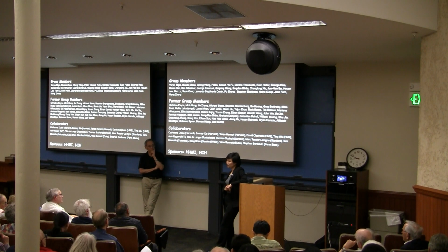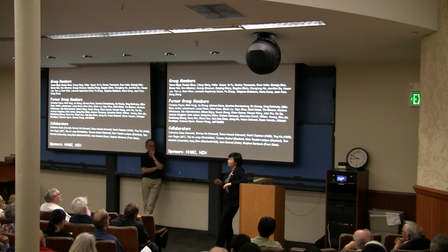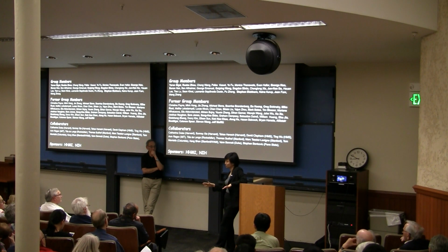So if we use some of the perturbations that we have, such as disrupting the actin to remove the entire structure, or knocking out the spectrin to remove the entire structure, it does have influence on the action potential pattern. But it's hard to interpret those results because the sodium distribution changes, and the amount of ion channels getting into the axons gets substantially reduced.